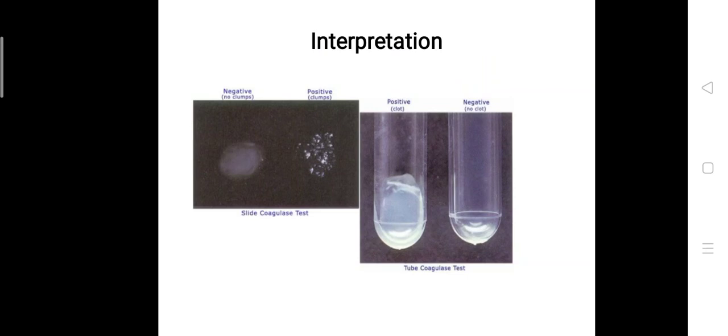If the test is negative after incubation for four hours or six hours, you can see in the negative here there is no stable clot or coagulum. In this case of negative tube, you have to re-incubate at room temperature for 18 hours again. After incubation of 18 hours, if there is still no formation of a coagulum, then the test strain can be reported as a negative coagulase test.